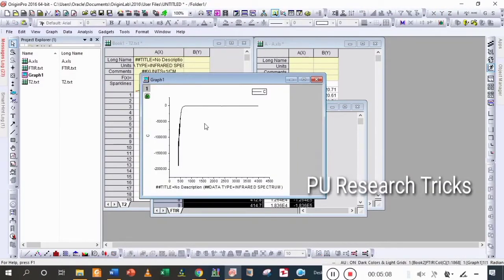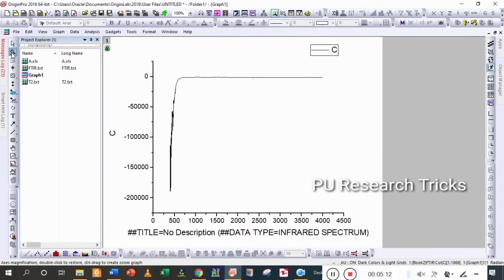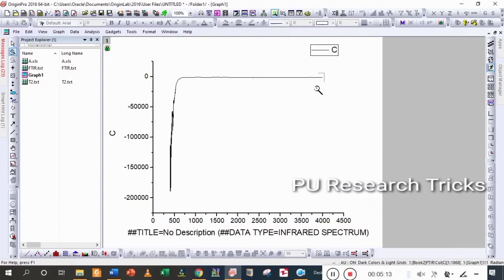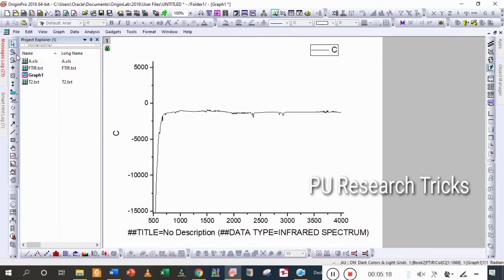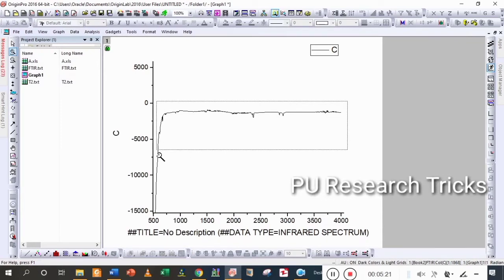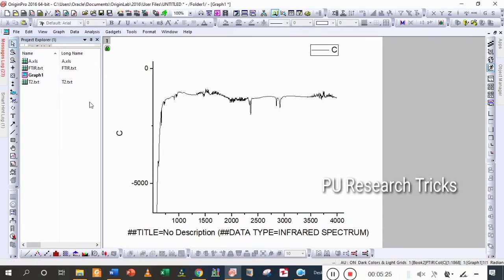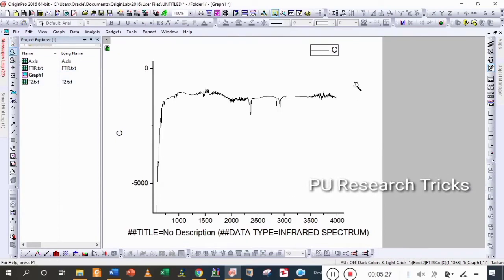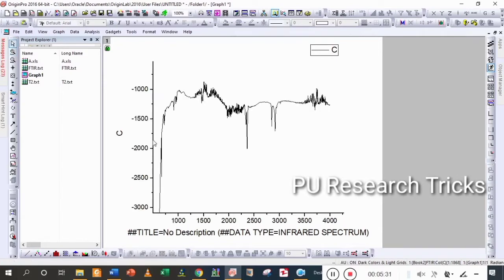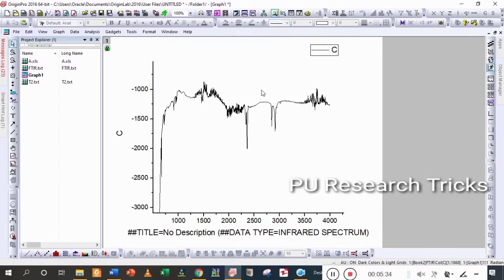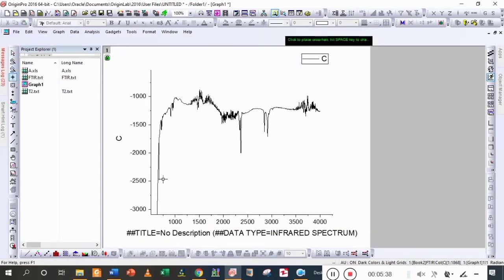You can see that the peak values are changing from upward to downward. Zoom it and you can see that its values are becoming downwards. However, there is a problem — a long curve line is observed which is going downwards, and we are going to remove it.